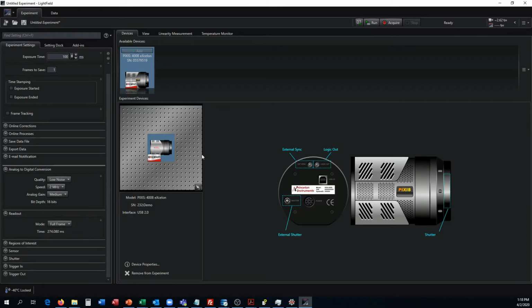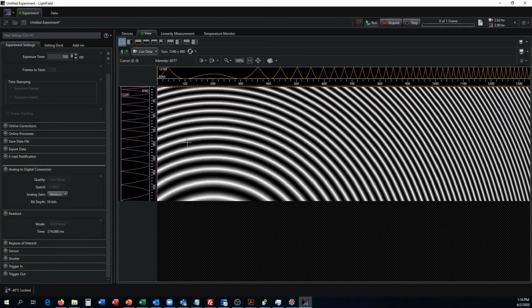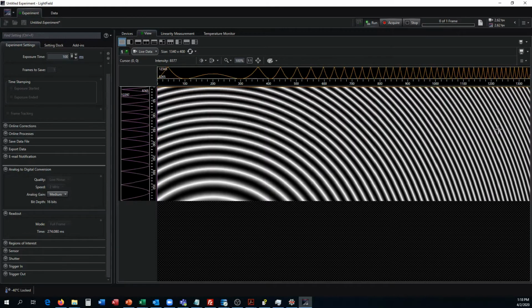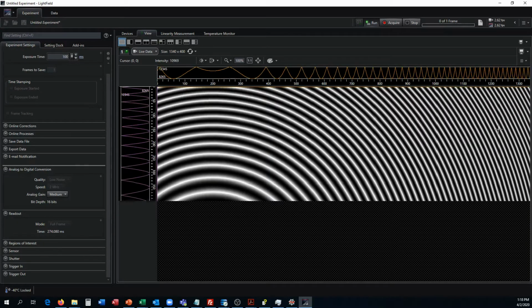So what does the software emulated camera do? Well, let's say you're going to acquire some data with it. So I'm just going to hit F9 to start an acquisition, and you can see this is the software generated data that's coming out of this emulated camera, and you can see it's an array function. So this is just a placeholder.